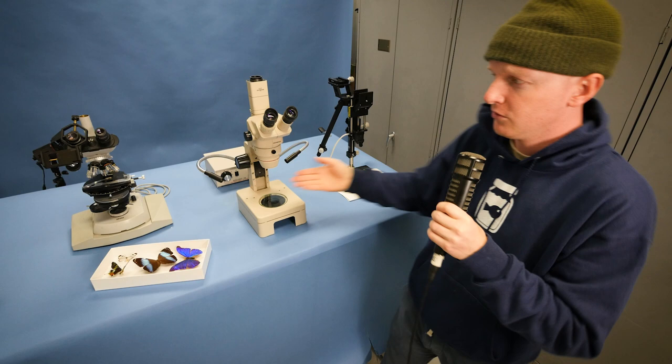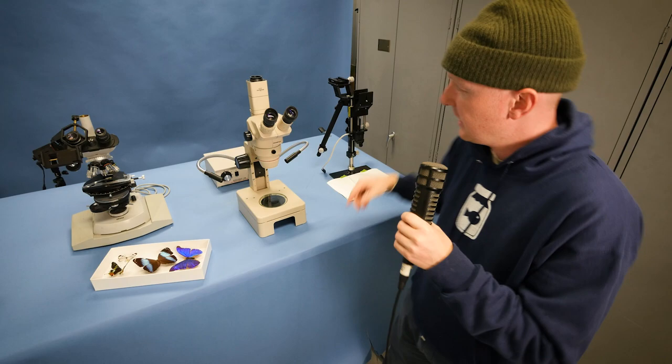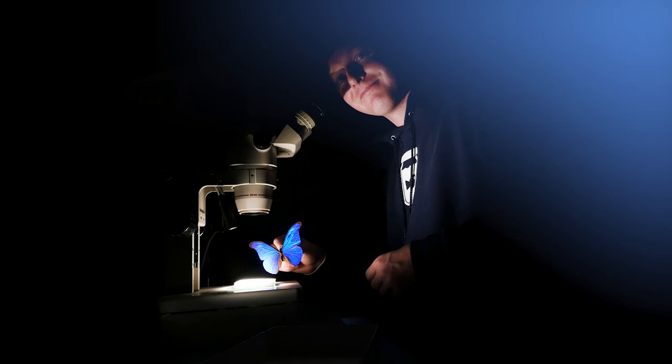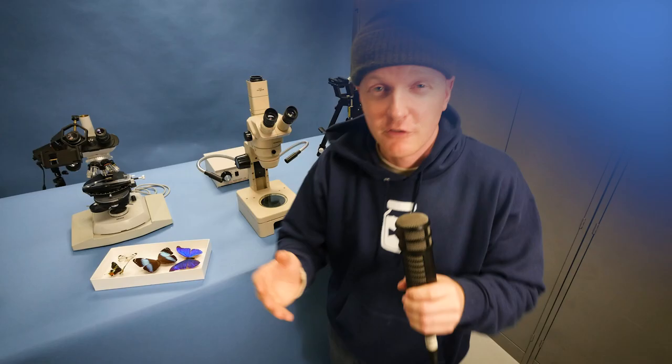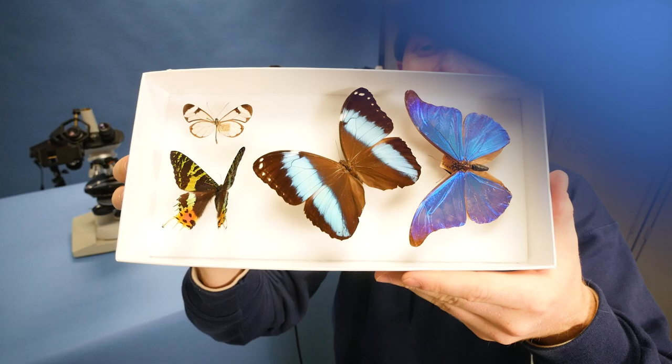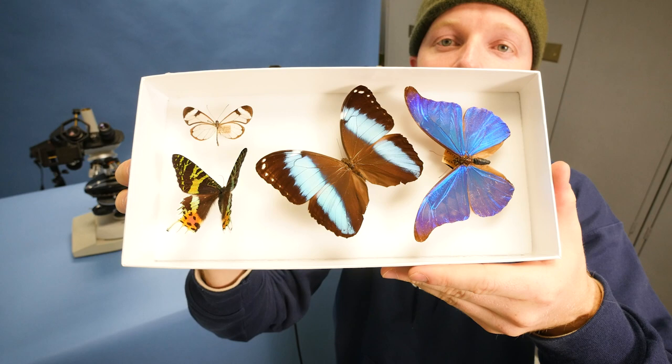Compound microscope that gets super up close. Stereoscope that gets a little farther away. And here's just a stand for the camera. We're going to throw all these butterflies and moths under the scopes and see what they look like very up close. I think it's going to be pretty cool because we have a variety of specimens right here.